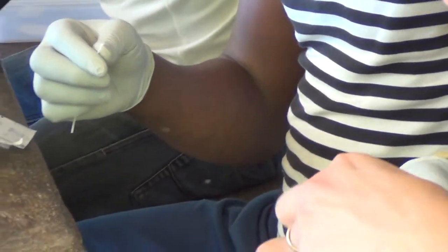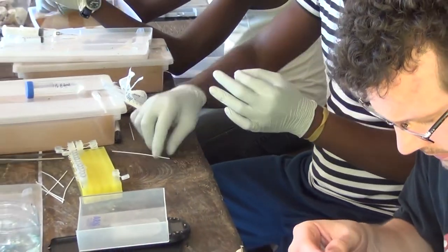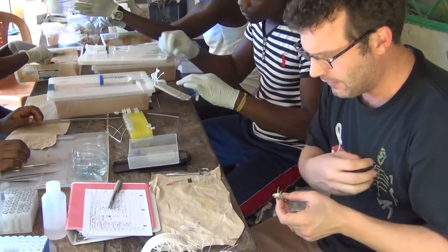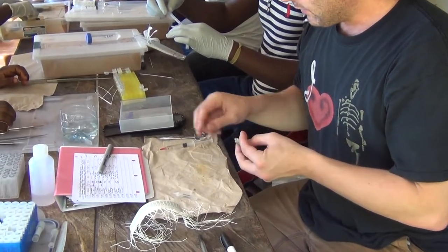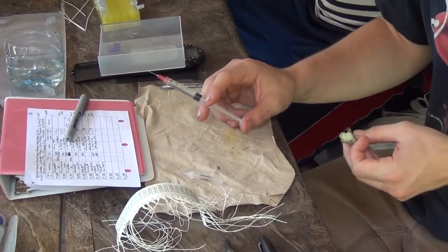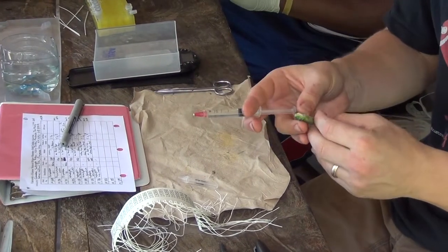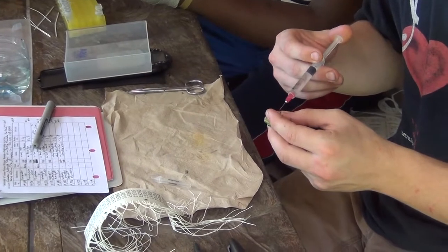One thing to note is sex. In this genus of frogs we can identify the sex by little glands on its chest — this is a male. The first step will be euthanizing the frog, and we do that with a solution of MS-222, or tricaine. There are a variety of different chemicals used for euthanasia; we are going to inject a very small amount for this frog.